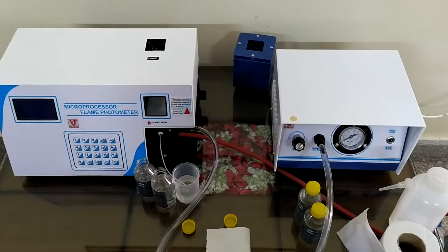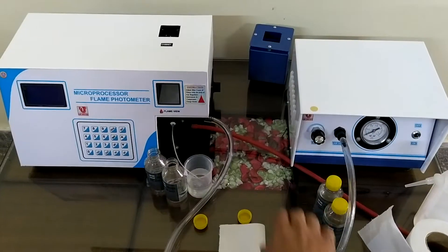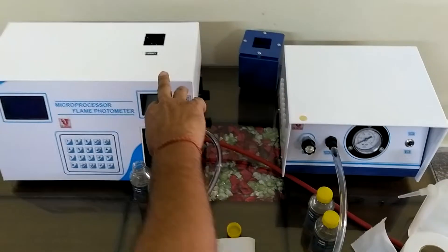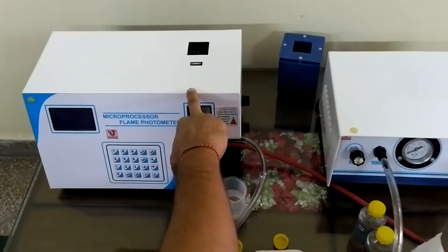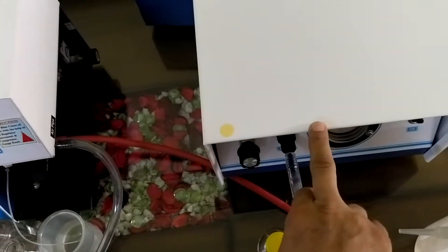Lab Junction Microprocessor Flame Photometer. This is the complete unit. Unit 1 is the main unit — the microprocessor flame photometer — and Unit 2 is the compressor.